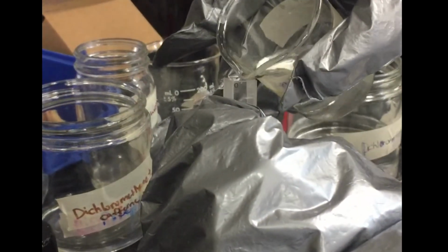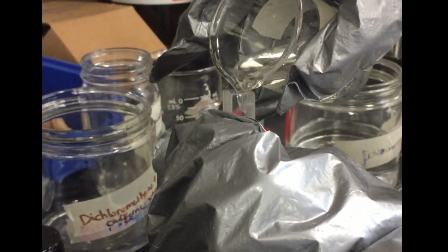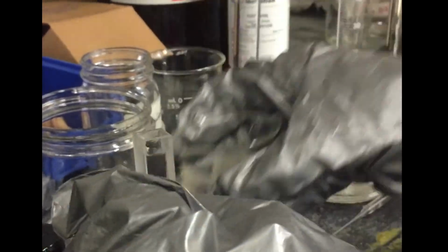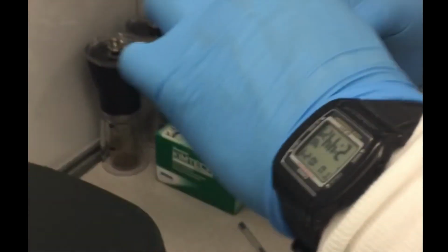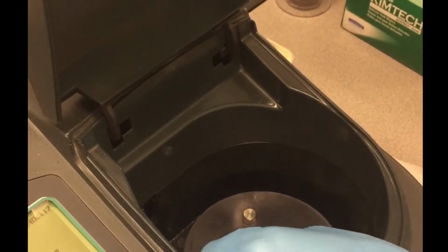Lastly, the collected caffeine extract and DCM is then transferred into a cuvette. This cuvette is brought over to the spectrophotometer. The sides are wiped down with a Kimtech wipe, and the cuvette is placed into the slot within the spectrophotometer in a way where the clear sides are facing the front and back of the machine. The absorbance can then be seen on the digital display.